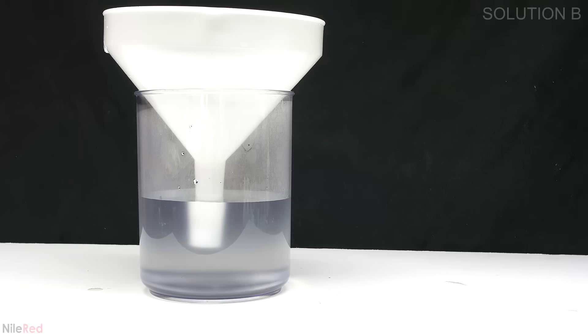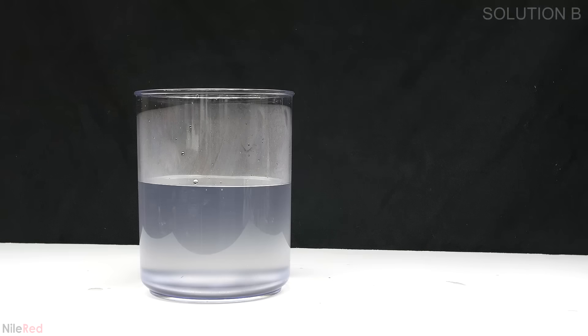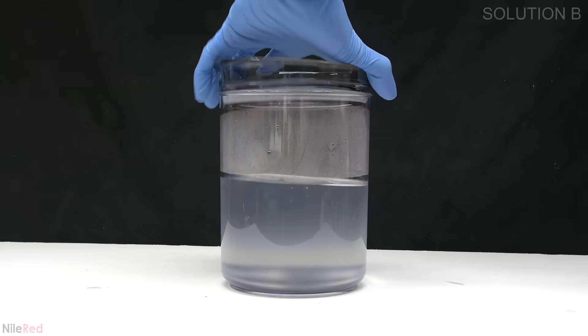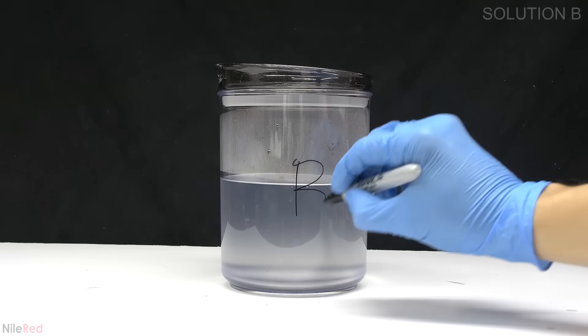The best idea is to just be patient and to only filter things after it reaches room temperature. Once everything had filtered through the funnel was removed and I labeled the container. I let it sit for a couple hours to cool down and I re-filtered it before moving on.